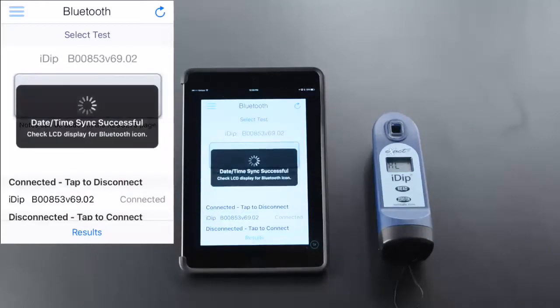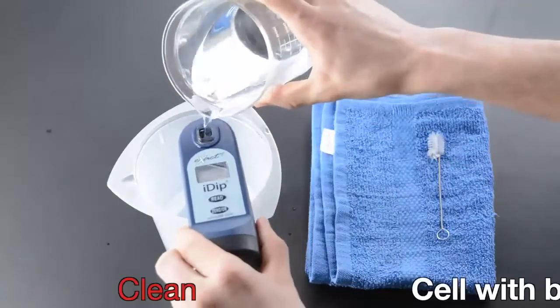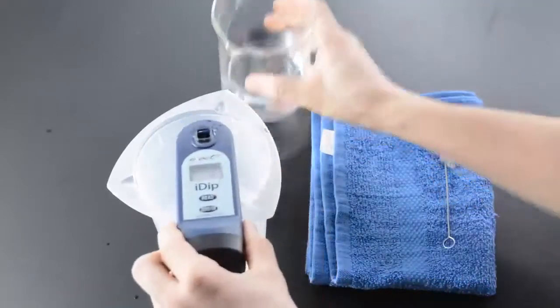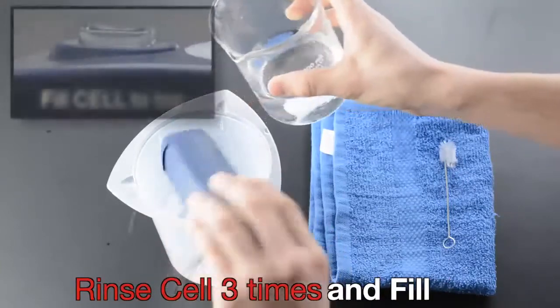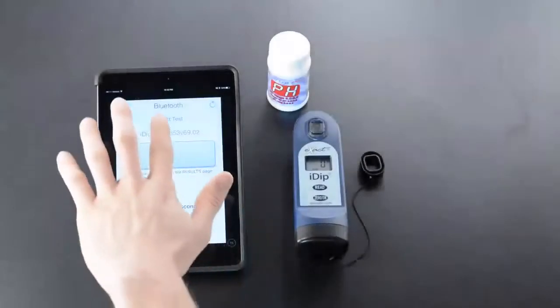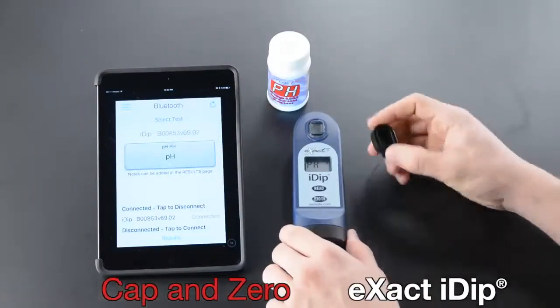Clean cell with brush, rinse cell three times, and fill cell to top. Select test, cap, and zero.